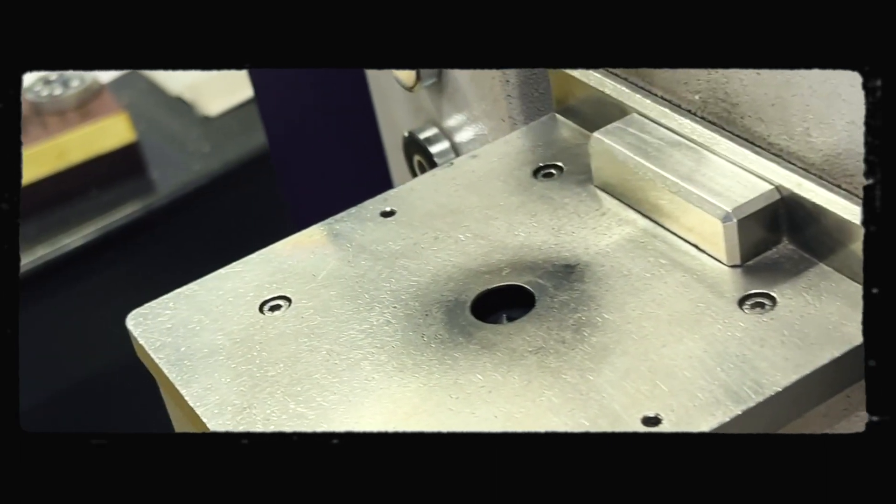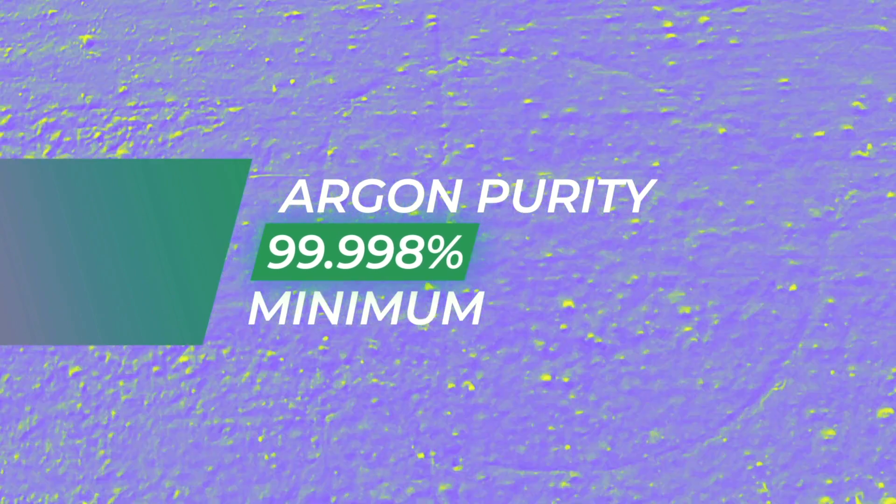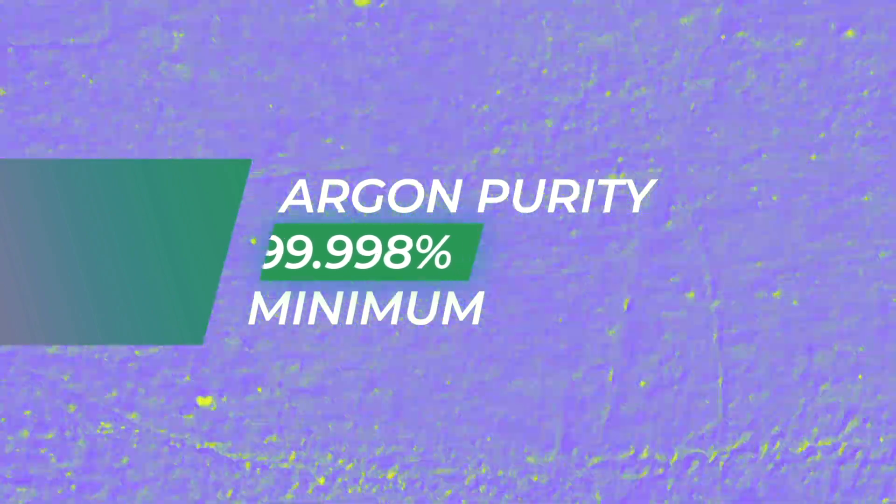Point number two: the surface should cover the entire specimen stand and no air gap should be present. The oxygen in air can interfere with the results of light elements. Point number three: the purity of argon can influence your results. The purity is therefore kept to over 99.998 percent at minimum.